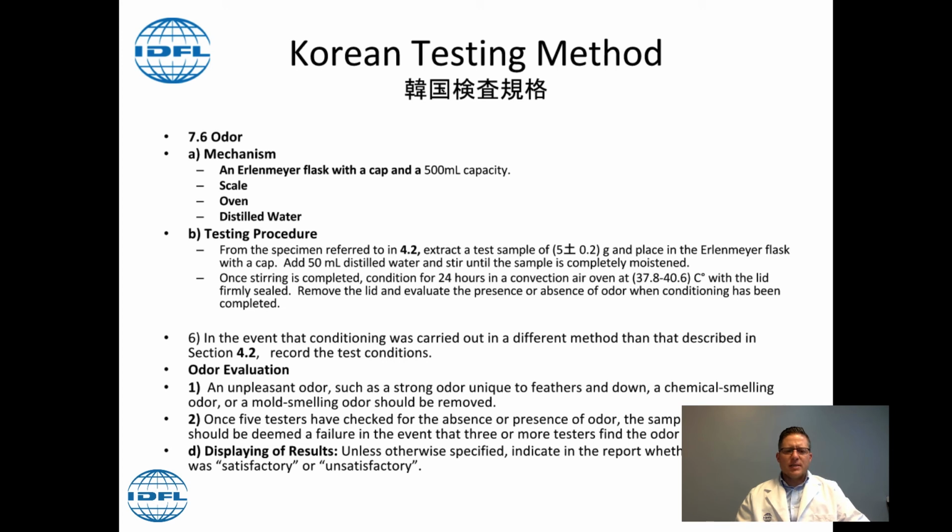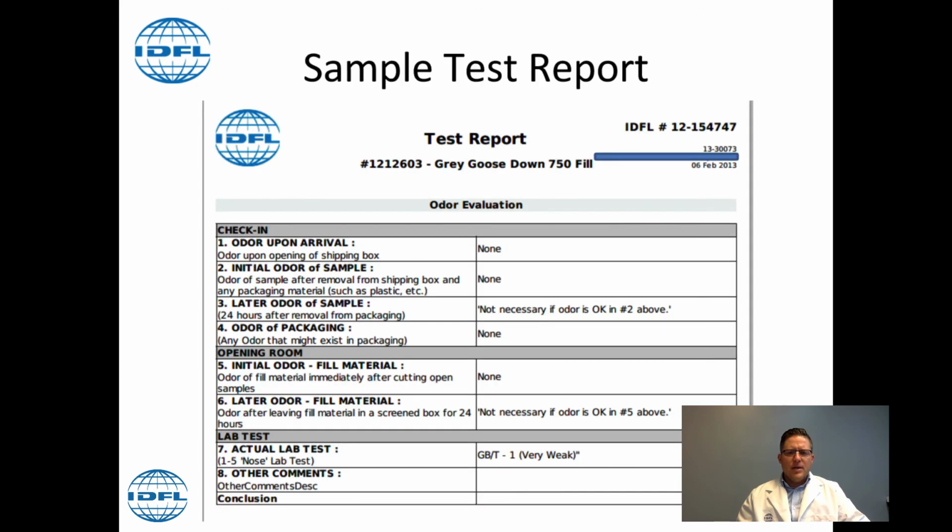There is a Korean testing method that is very similar. This is listed right here. Here's also a sample report from an IDFL test method. You can see the different steps, 1 through 8: odor when it arrives, the initial odor of the sample, later odor of the sample, moving on to the odor of the packaging, smelling the packaging to see if it has any influence.